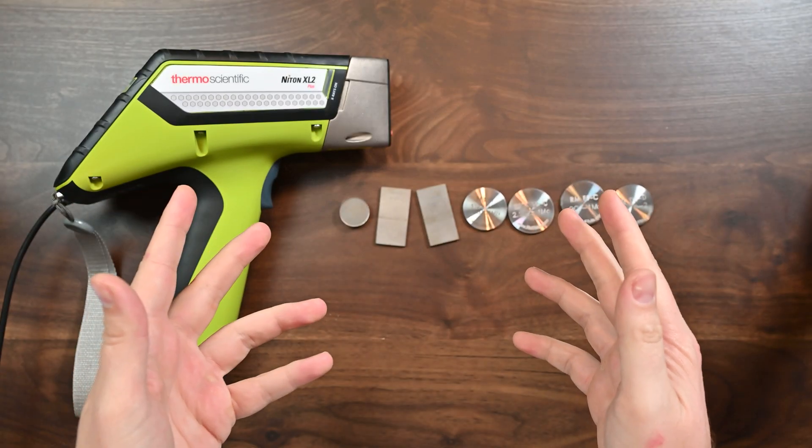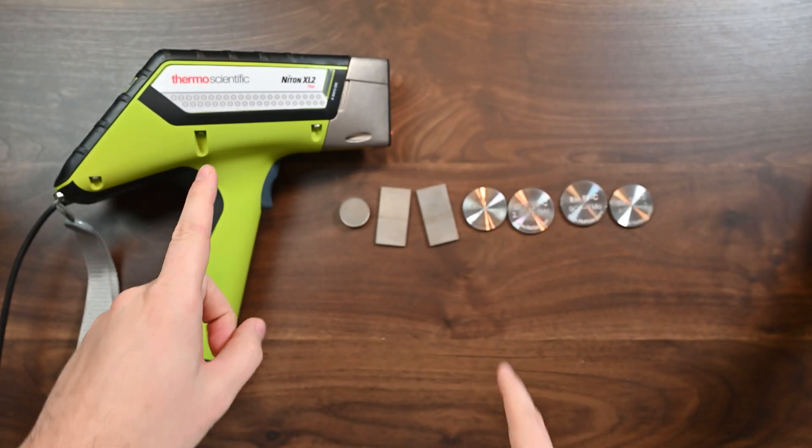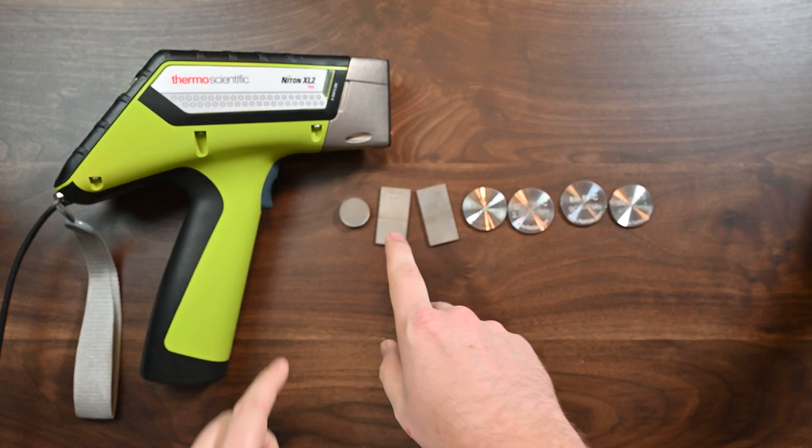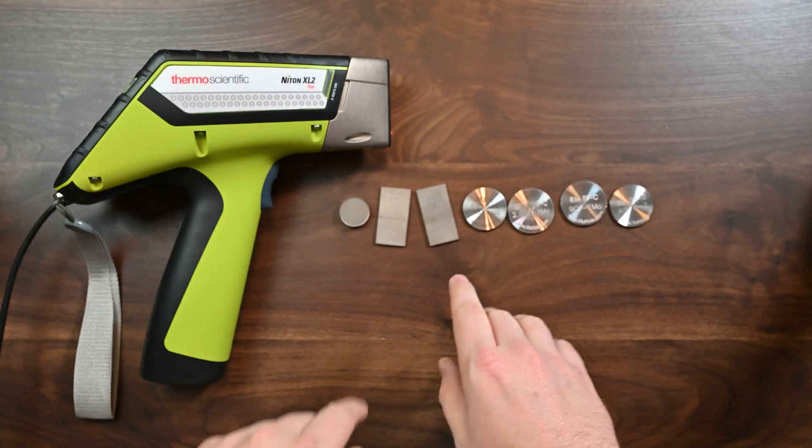Hi guys, welcome back to another Alloy Geek episode. Today we're going to talk about the Thermo Scientific XL2 Plus and how well it does on low alloy steels and chromoly steels.